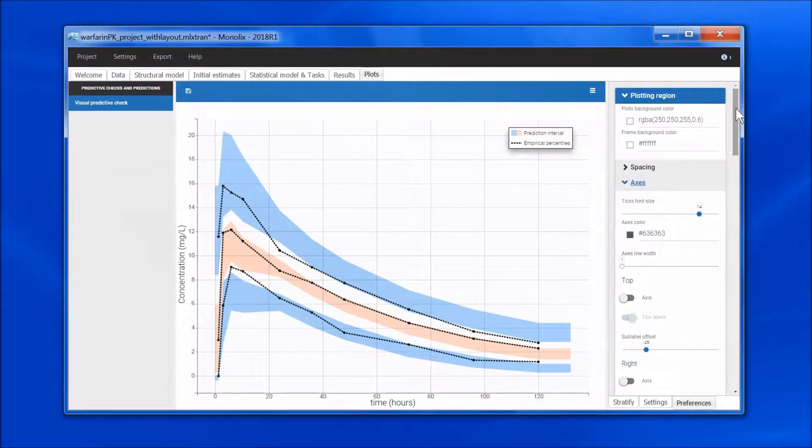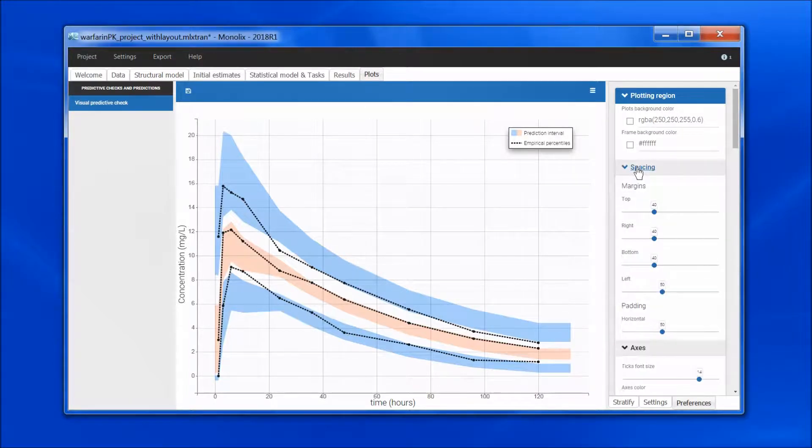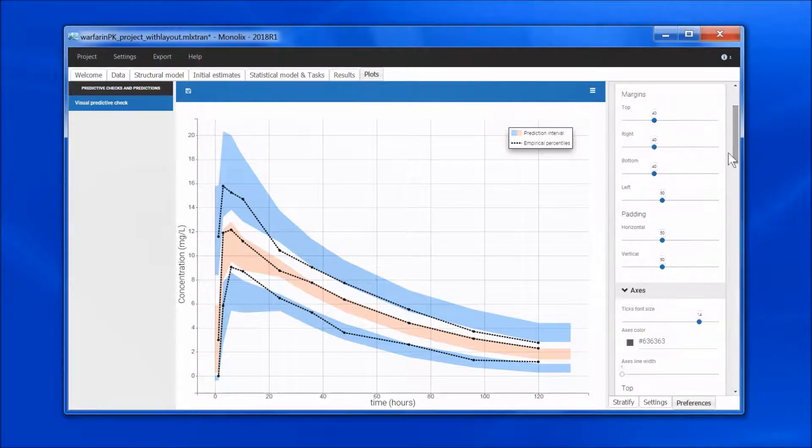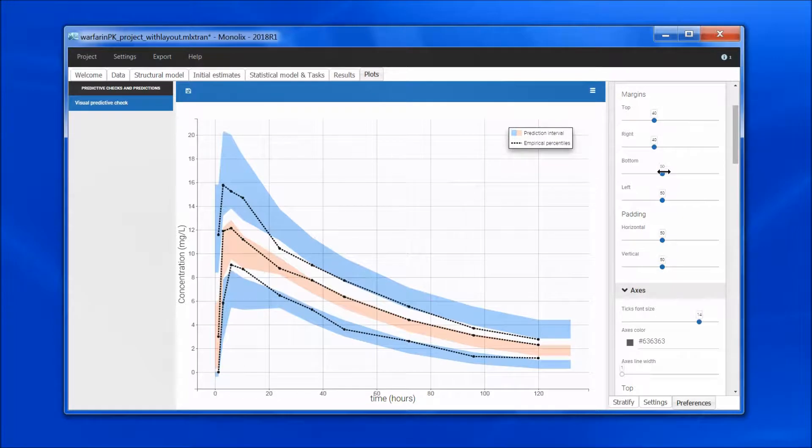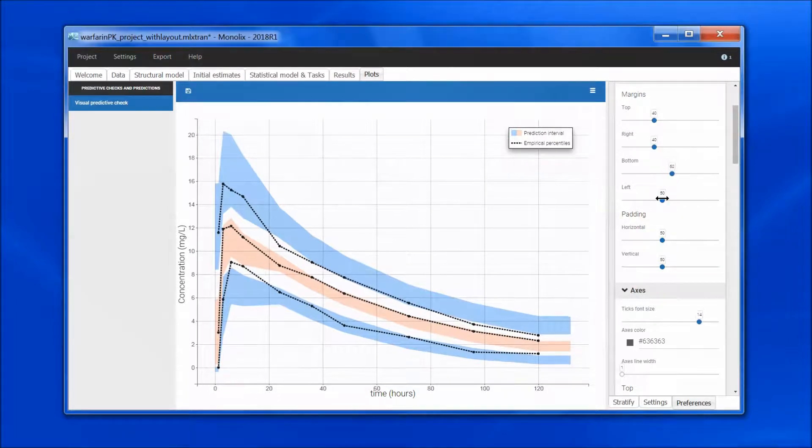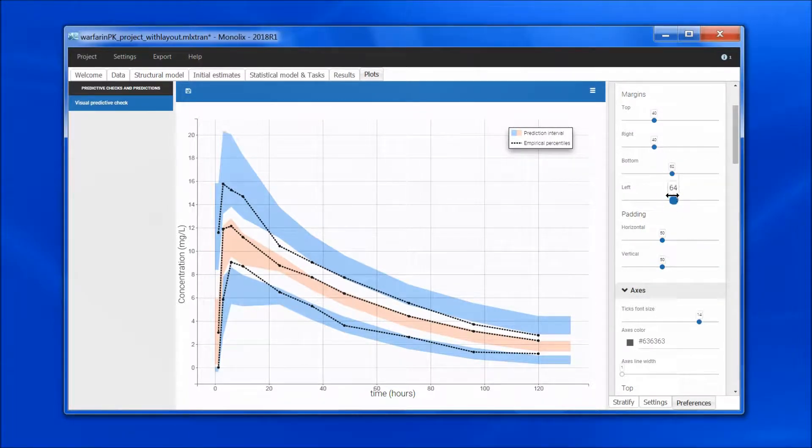In spacing, for the bottom, I am going to increase it a bit. Same on the left side.